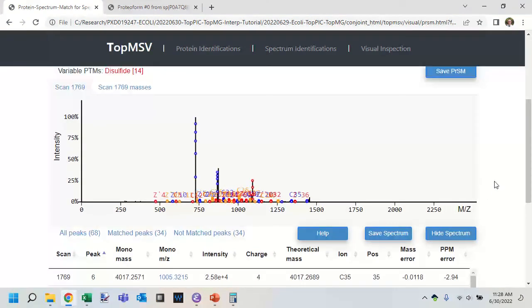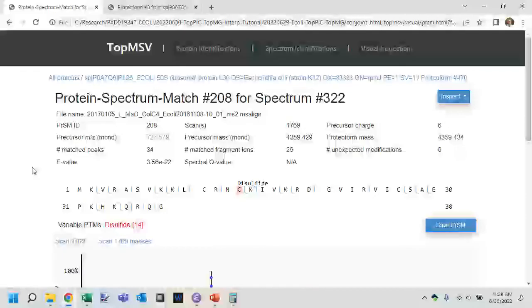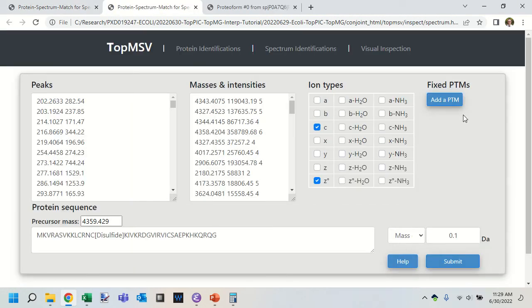Okay, so now I am looking at m/z values and how they relate to it. It is possible this is one of the reasons why the files created for these reports are so huge. Each spectrum is represented as a JavaScript object that allows us to do a close-up examination of these spectra. But I'm being kludgy today, so I'm not sure I'm going to be able to show all of that. So here we are able to do this interrogation of these spectra and look at them up close and personal. That's rather lovely. So now we have a spectrum viewer.